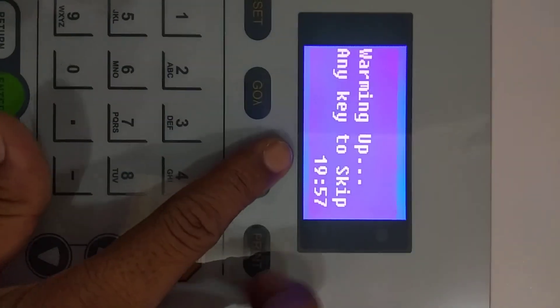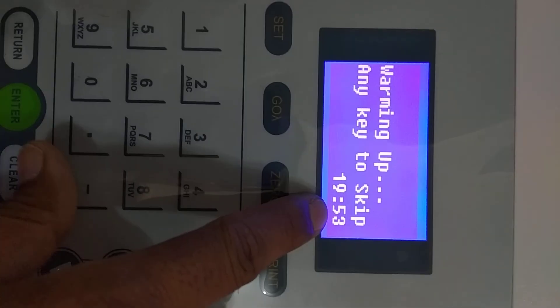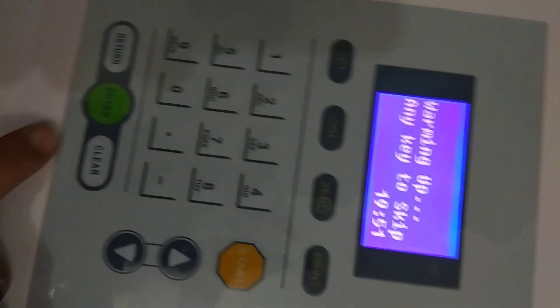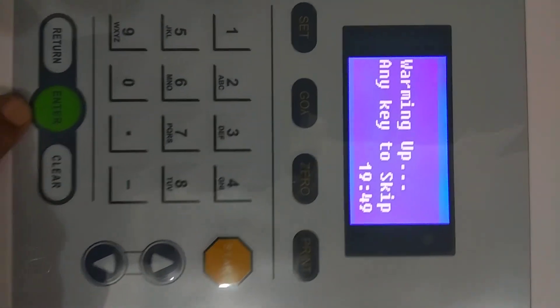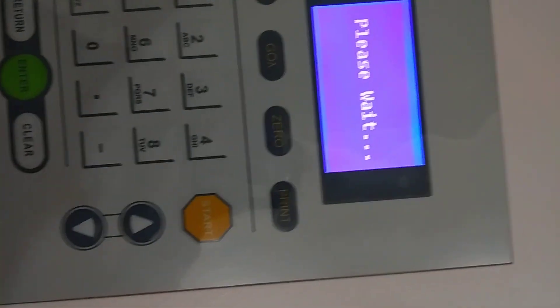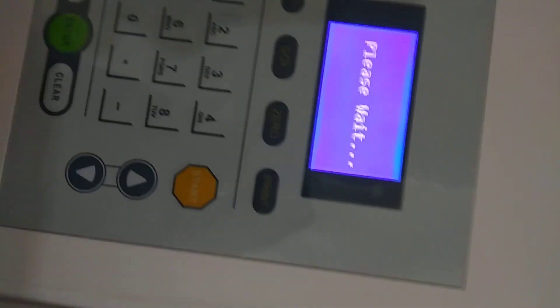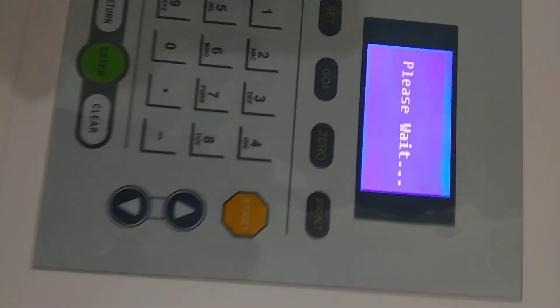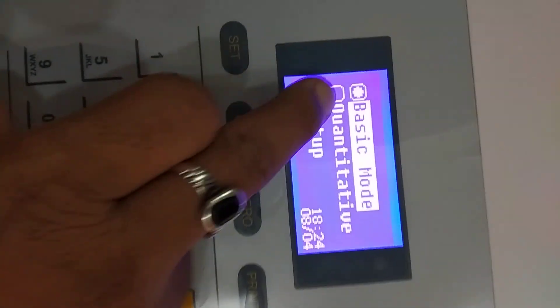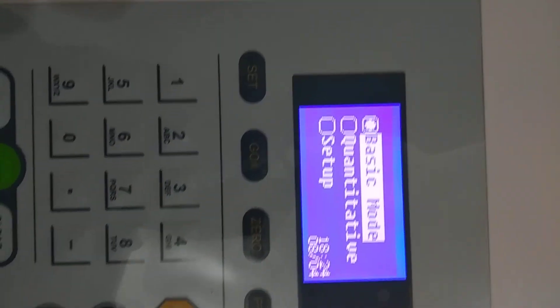After the system check completes, a 20-minute warm-up timer will appear on the screen. You can skip this by pressing any key on the keyboard, but it is recommended not to skip this warm-up time.